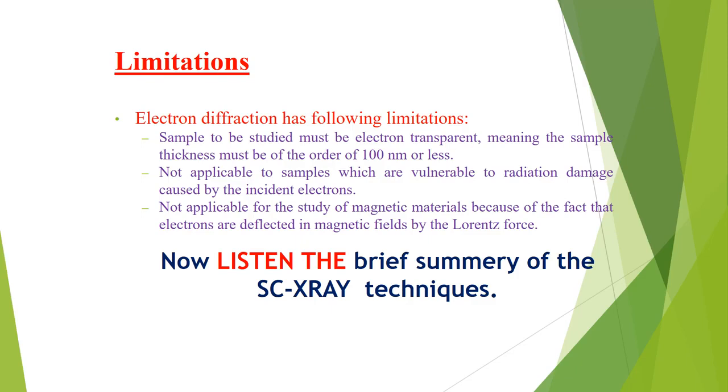In the theoretical background of the single crystal X-ray technique, there are some points to remember.